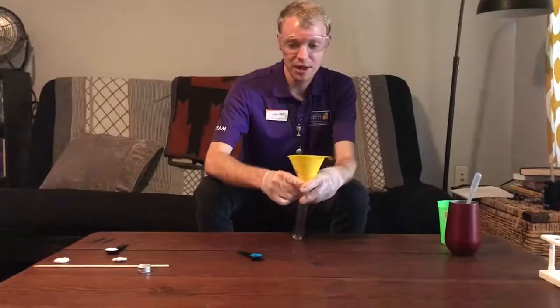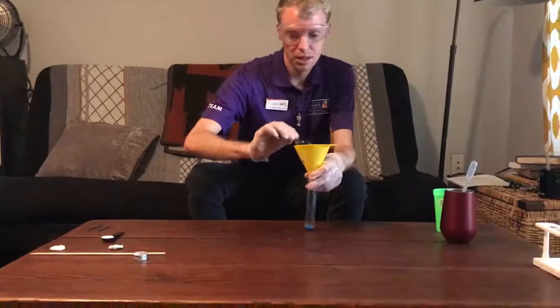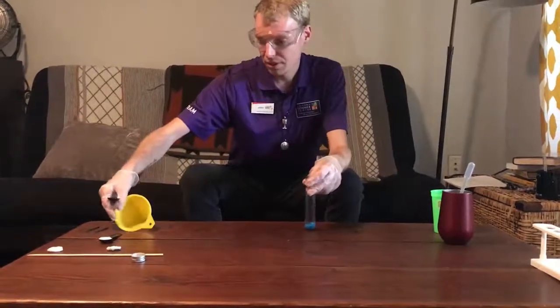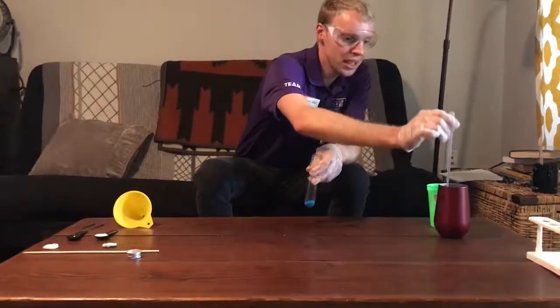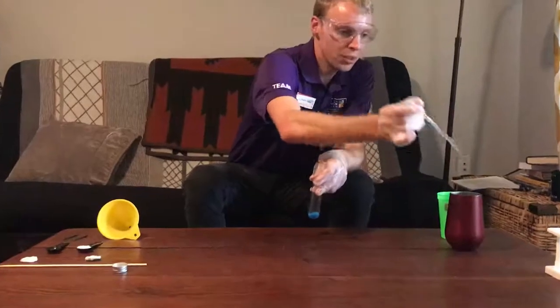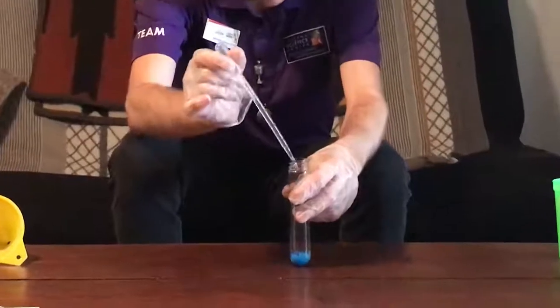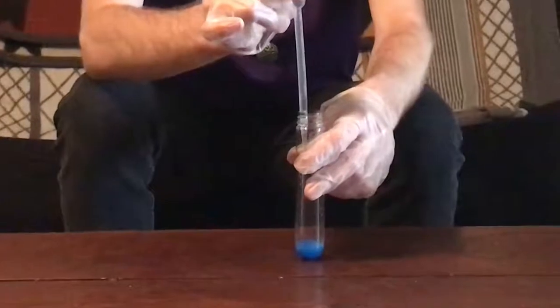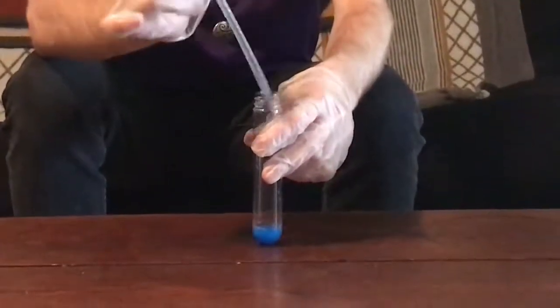So I'm going to take 5 grams of copper sulfate, and I'm going to pour that in here, and make sure that it all goes down to the bottom. Put the funnel to the side. And I'm going to use a pipette just for a little bit of precision. Inside this cup is just water. So I'm going to take my pipette filled with water, and I want to make sure that I have just enough water to cover all of my copper sulfate. So it's filling up the bottom, and I want to make sure that I have just a thin layer of water on top, like that.